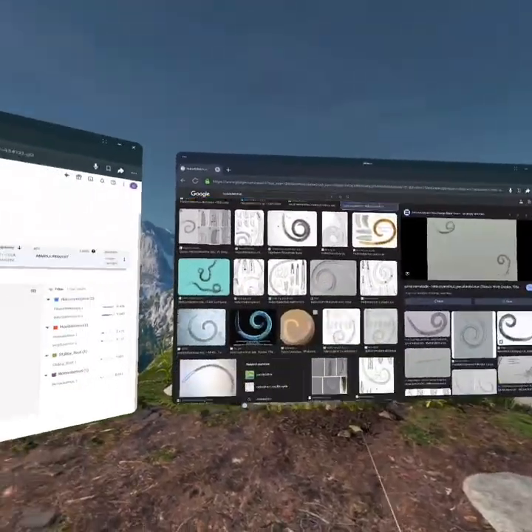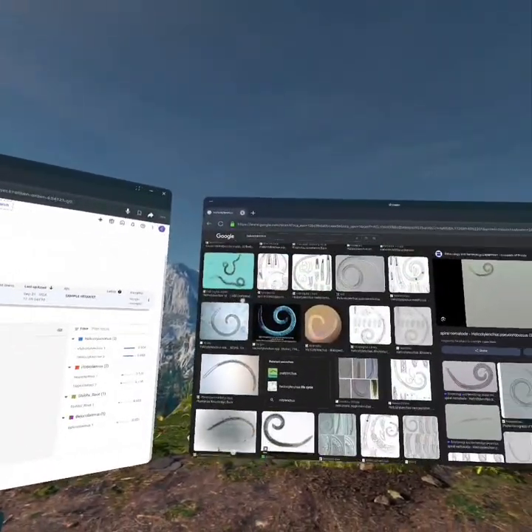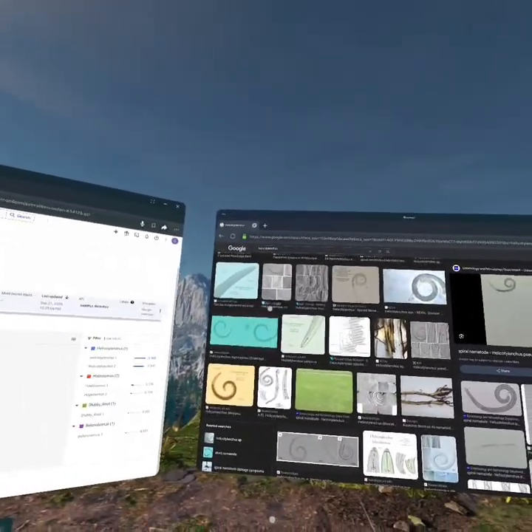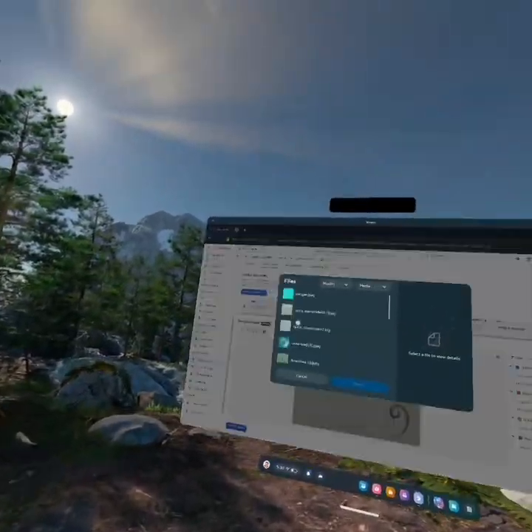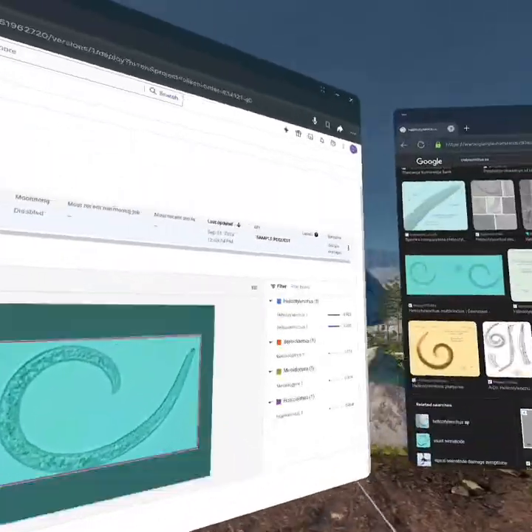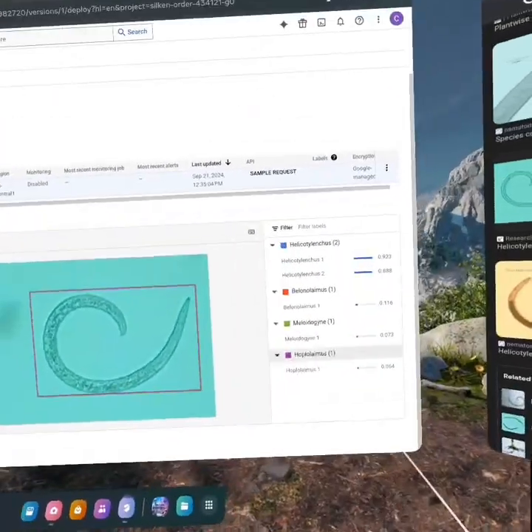Let's do another photo here. Or was that other one not the multiple ones? Well, there's one right there. Where's that other one? Here we go. Download. Okay. See what we get? All right, once again, it'll hit both of the nematodes there. And for one, it's giving me a 92% probability and an 88% probability, which are pretty good.